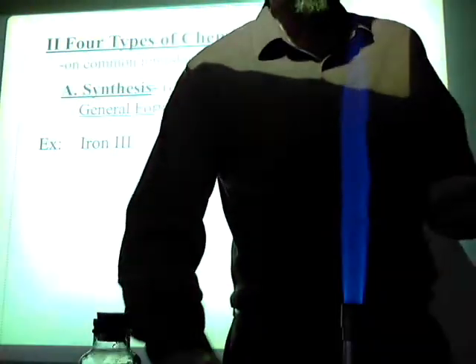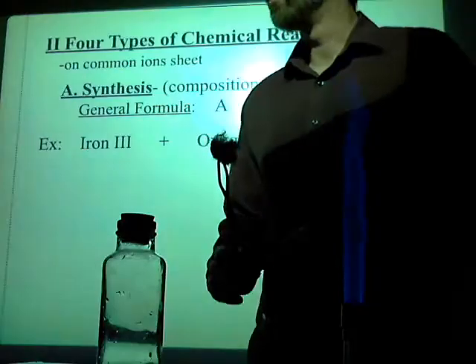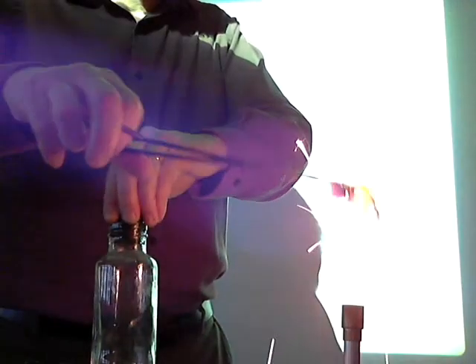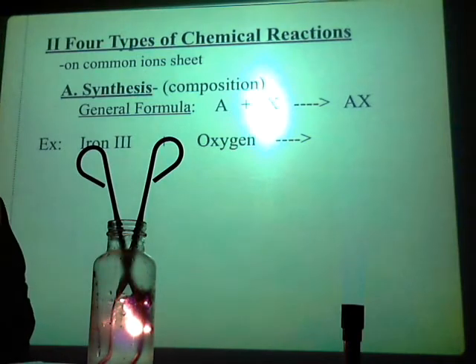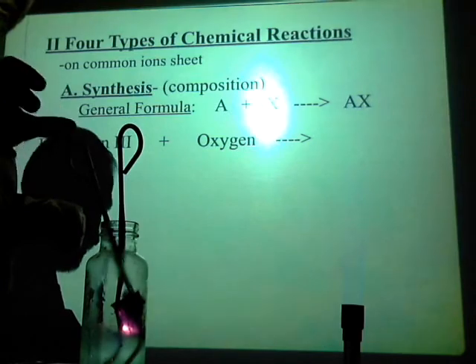Check this out. Well, I got to do this one on the thing here, though, so that we're on tape, by the way. So the folks at home can see this. Okay, you ready? I better stand in front of it like this, I think, too. All right, got to get them hot, and then I'm going to put them in here. Wait, loosen the top up a little bit. You ready? Okay, burns a little bit better there, huh? Isn't that cool? I think it's cool.